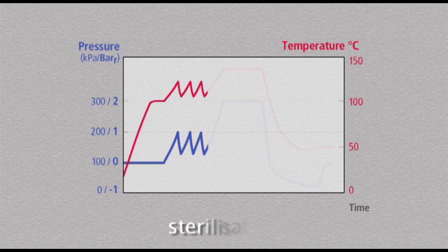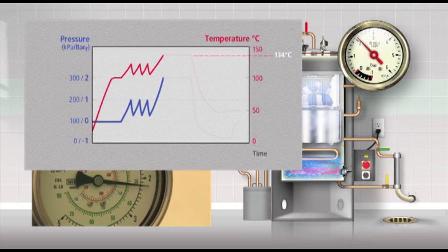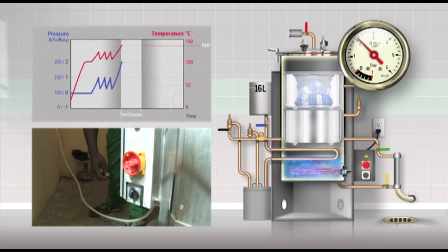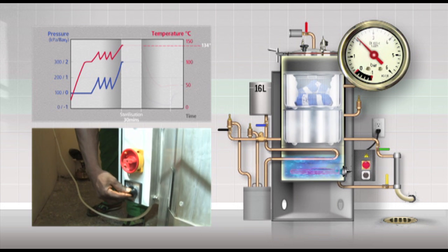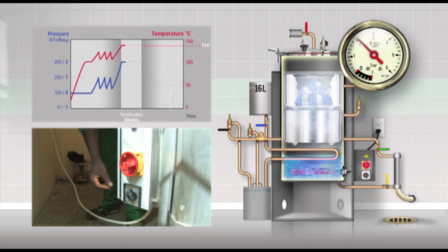Now let the pressure build up until it reaches between 2.0 and 2.2 bar, which is 134 degrees Celsius. At this point sterilization starts. Set the timer for 30 minutes.